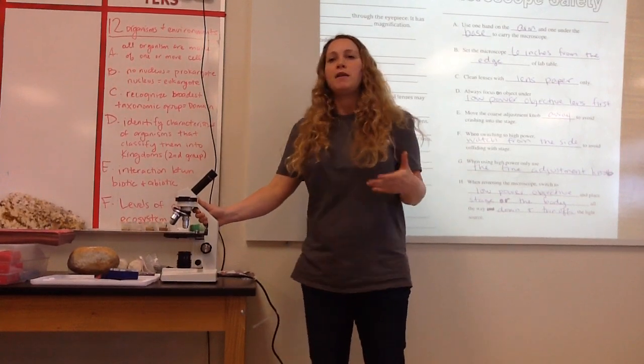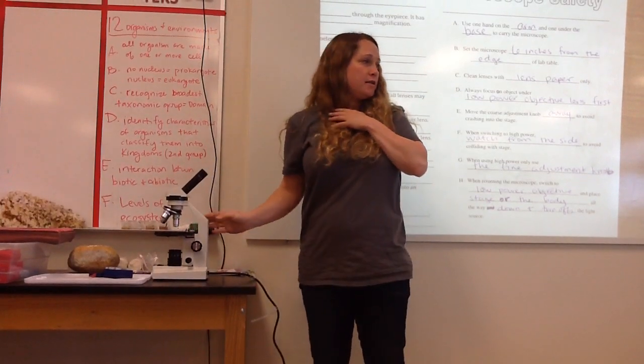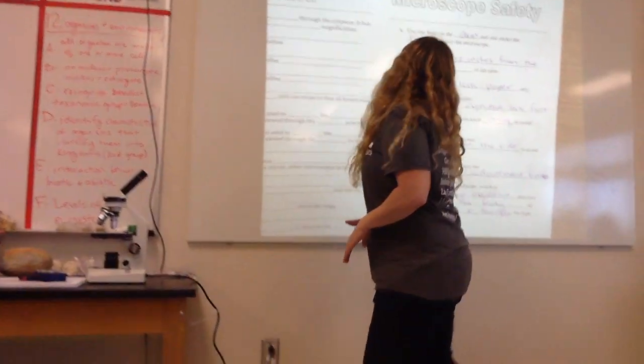While you're using it, you might be like, I can't see, it's too far away. So you can bring it close to yourself temporarily and then push it back for safety. Does that make sense, guys? Okay, so as usual, take care of any equipment in science, but this one's really important.